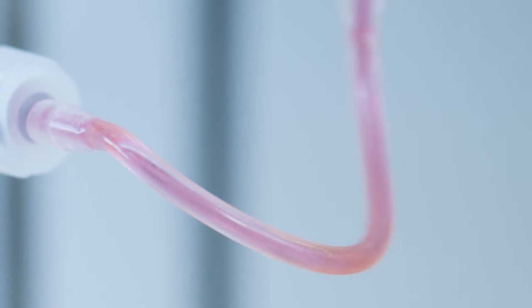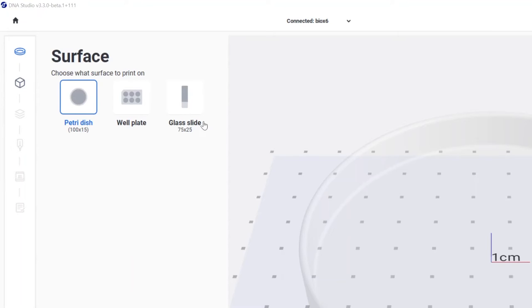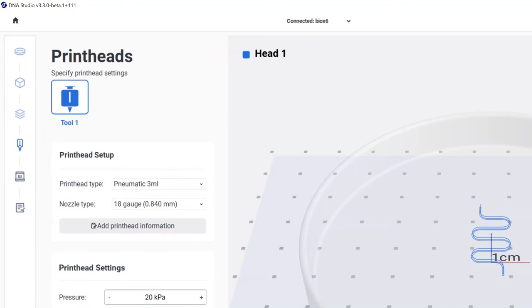Now let's go through the bioprinting settings. Open the DNA Studio — from here the software connects to the device. You can select the specific plate that you are going to print on; I'm selecting the Petri dish. Specify the layer height based on your selected nozzle, infill pattern, and density. Then select the printhead type and choose coaxial from the list.